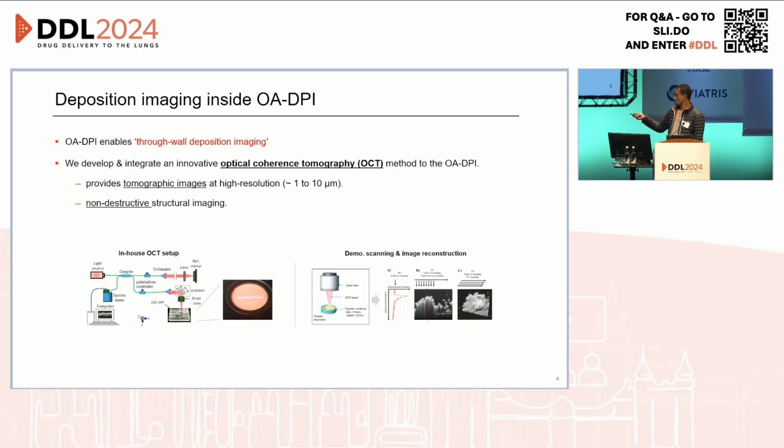But simply put, with OCT you project a beam onto a sample, and then we scan using a galvo technique. If you point at a single point in the sample, we get one depth profile, and by repeating this we get multiple depth profiles, which can be reconstructed into one cross-sectional image. Then we finally get a 3D image if you repeat this cross-sectional imaging.